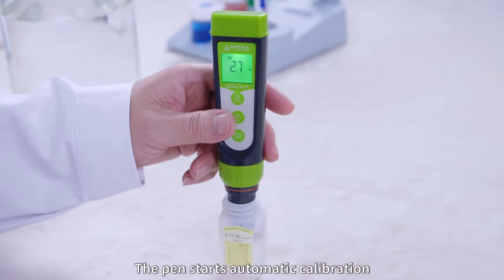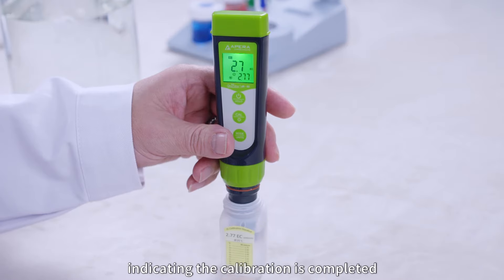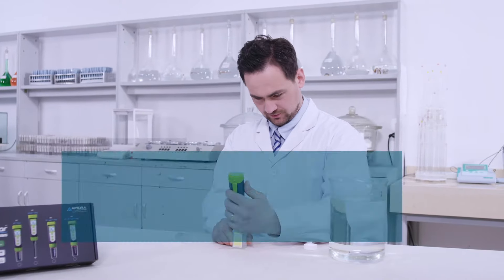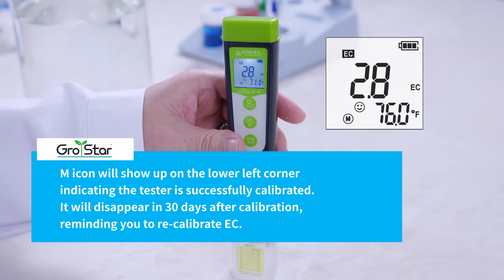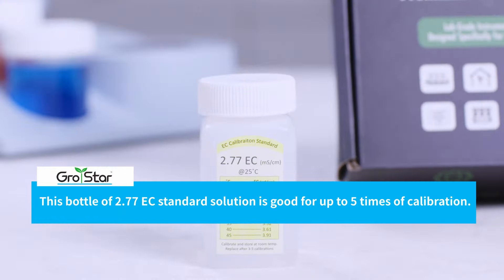Hold Cal until the screen turns green. The pen starts automatic calibration. Wait for 'Good' to show up in 10 to 15 seconds, indicating the calibration is completed. Then the pen returns to measurement mode. The M icon will show up on the lower left corner, indicating the tester is successfully calibrated. It will disappear in 30 days after calibration, reminding you to recalibrate EC. This bottle of 2.77 EC standard solution is good for up to 5 times of EC calibration. Afterwards, replace with a new one.